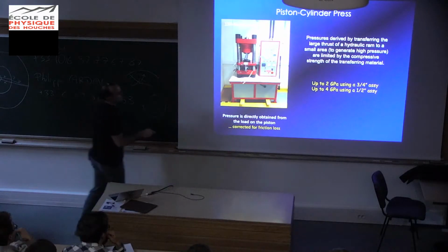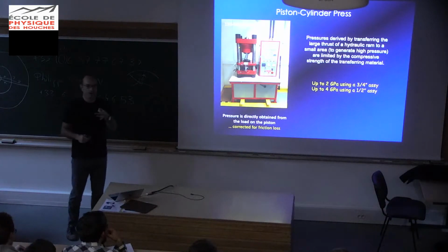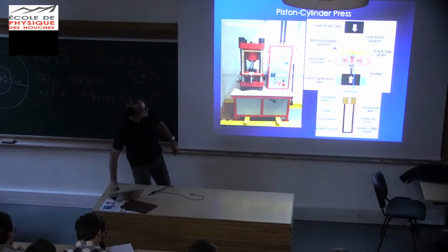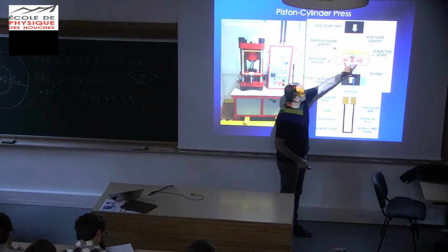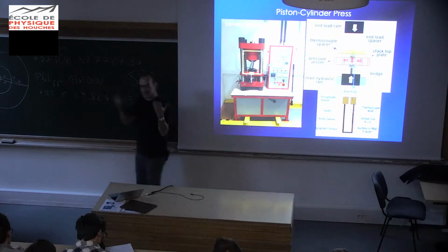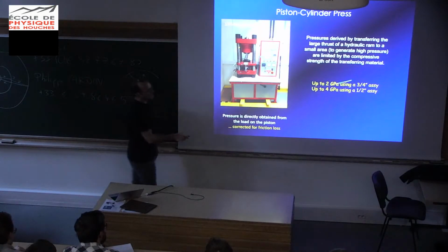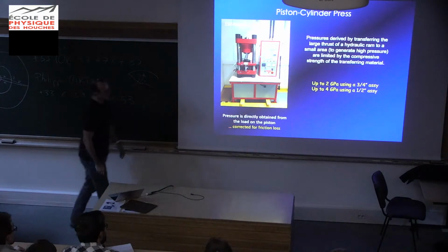So the pressure in such a system is obtained directly from the load on the piston. It's basically force divided by the area. We typically use 2 different areas for this assembly here, for this piston. So you have 2 different pressure vessels, a 1/2 inch and 3/4 inch. 3/4 inch gives you a bigger sample, 1/2 inch a smaller sample, 3/4 inch lower pressures, 1/2 inch higher pressures, okay? So you can get up to 2 GPa with a 3/4 inch assembly and up to 4 GPa with a 1/2 inch assembly. All right.